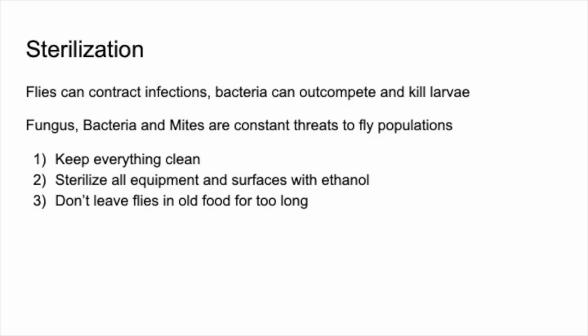You also want to be very careful about sterilization. It's possible for flies to contract and spread infections, whether it's viral or bacterial or fungal or parasitic. Any bacteria or fungus or mold that gets into the food will outcompete the larvae and kill them, which will ruin your experiment. This has happened to me before, where I've had bacteria absolutely destroy a huge amount of work that I was working on, and it was a terrible experience. So you want to be very careful.